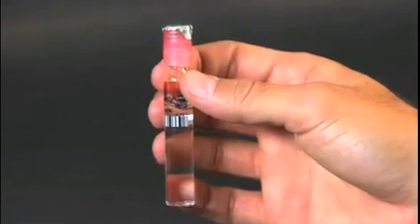First, notice the barcode that eliminates human error through automatic method and wavelength detection.